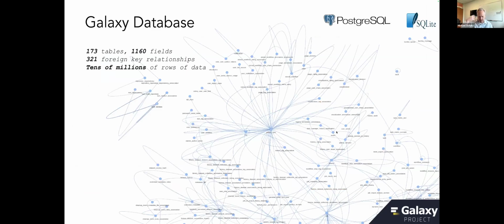Behind the scenes, again, there's a lot of tools, a lot of data, a lot of users. So there's a very detailed database that keeps track of everything for you. And again, from a user perspective, one of the main outcomes is you get that living lab notebook. You get that history of every tool you've ever run, every data set you've ever looked at. That living lab notebook grows on the fly, but there is a very detailed data model that has millions and millions of records in there. And we'll keep track of that, organized for you, so that you don't have to. So that's, I think, a huge feature for scientific research, that it's actually reproducible and also actually accessible, that all you need is a web browser.